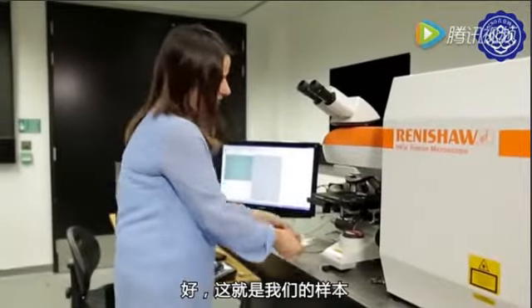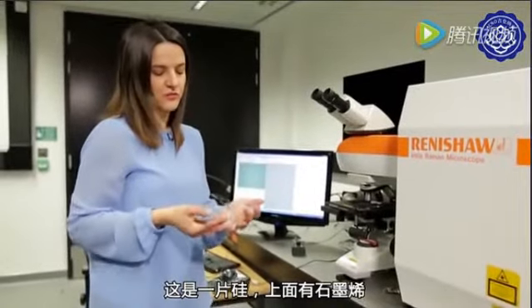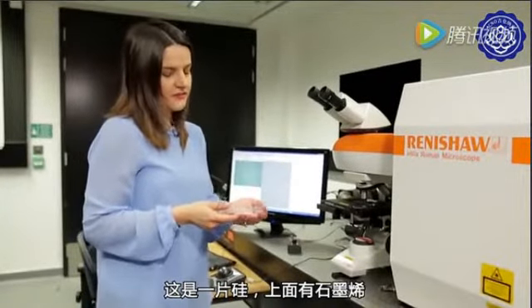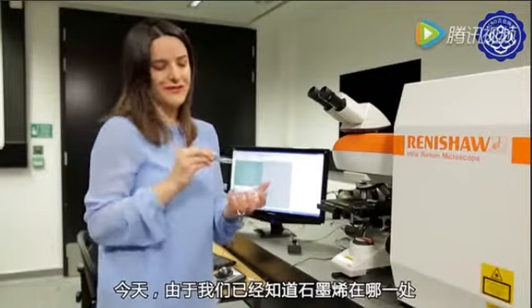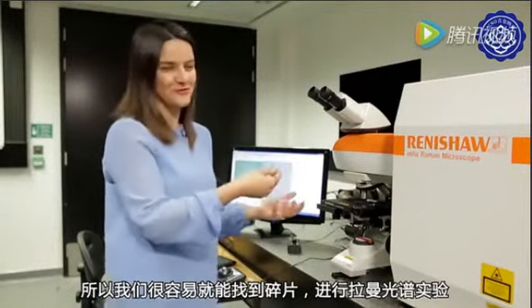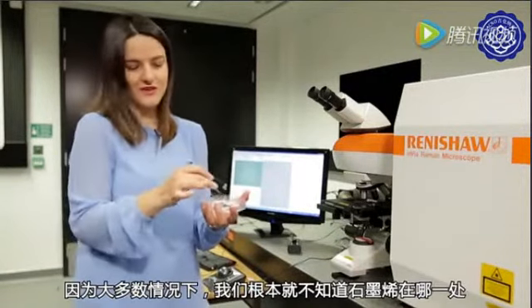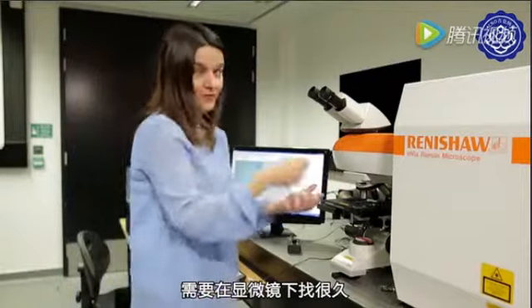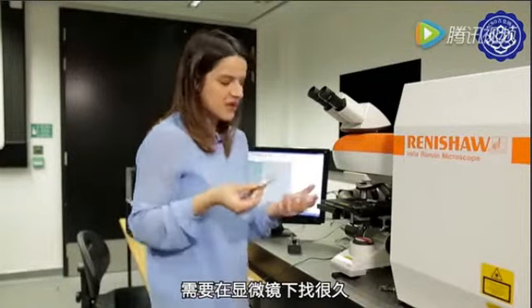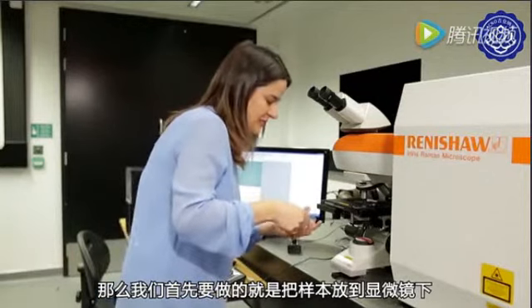Okay, so here we have a sample. It's a piece of silicon with some graphene on it. In this case, we know already where the graphene is, so it's going to be quite easy to find the flake and to do Raman spectroscopy. But in most cases, you have no clue where the graphene is, and you will spend some time looking for it under the microscope. So the first thing we have to do is to get the sample and put it under the microscope.